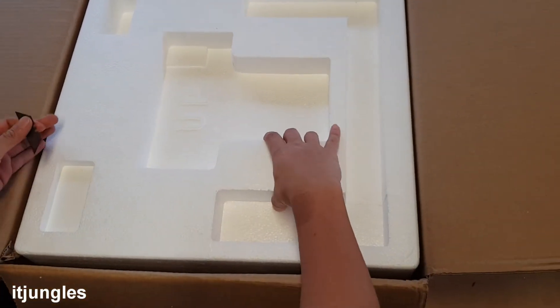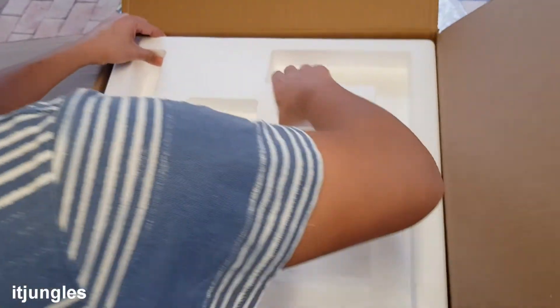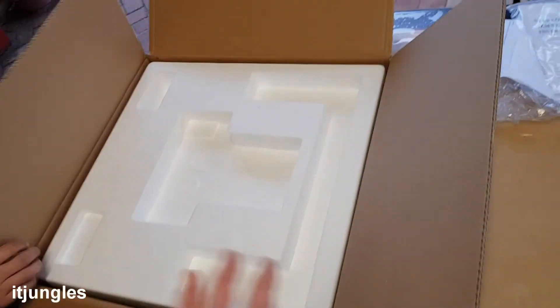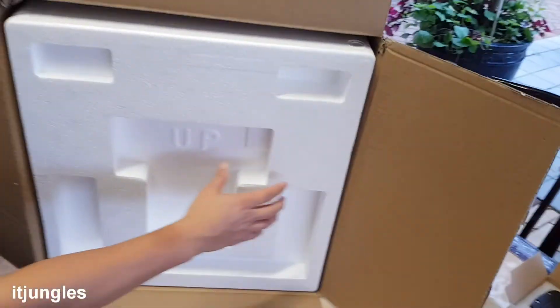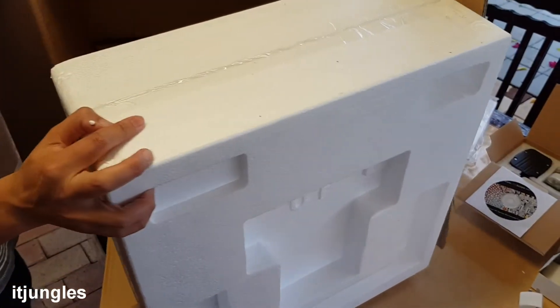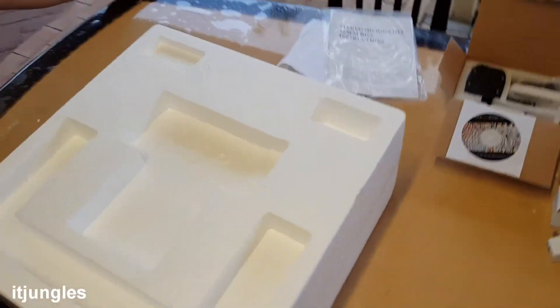So here you notice it's facing the right way. I have to pull it out — it's quite heavy. I need to stand up and cut off the top plate and move it out. So that is up.